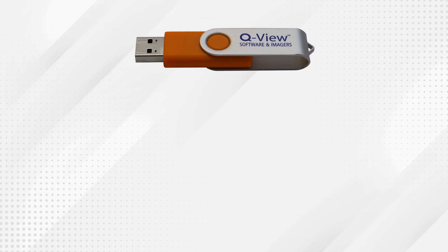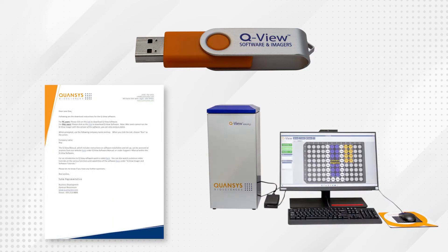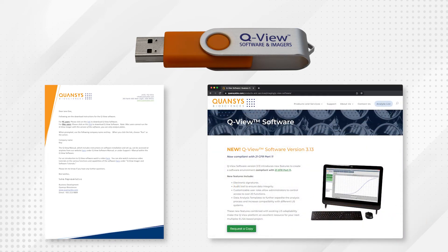The next step requires the use of the QView software, which is available on the included USB flash drive. Alternatively, a sales representative may have provided download instructions, or if you purchased a computer from Kwansus, QView software will come preloaded on that computer. A download of the software can also be found on the Kwansus Biosciences website. Be aware that without a license key, the software will function in evaluation mode, which provides full access to the software for 60 days.